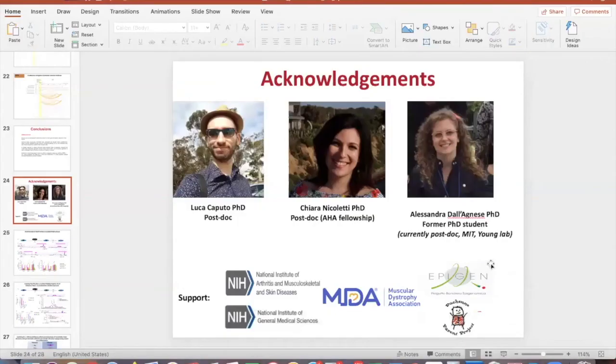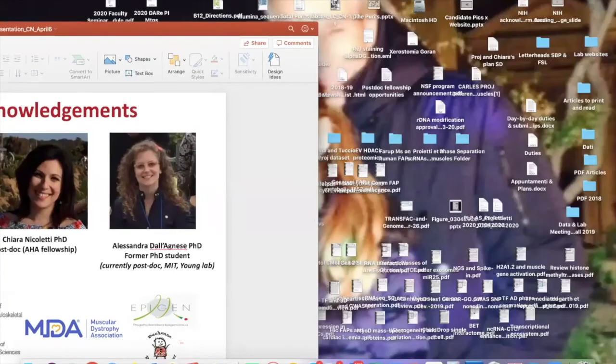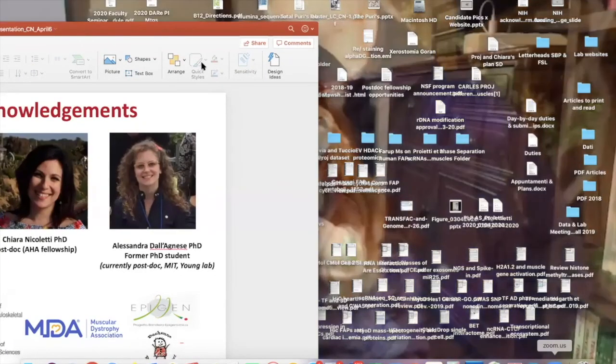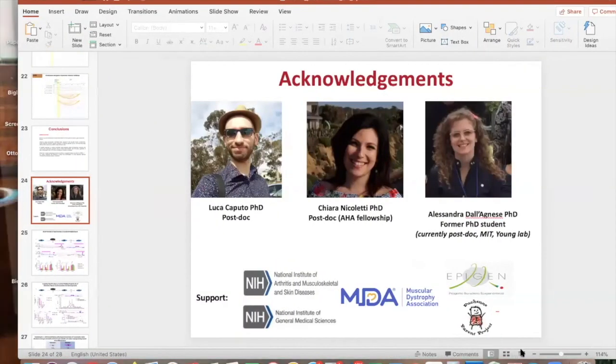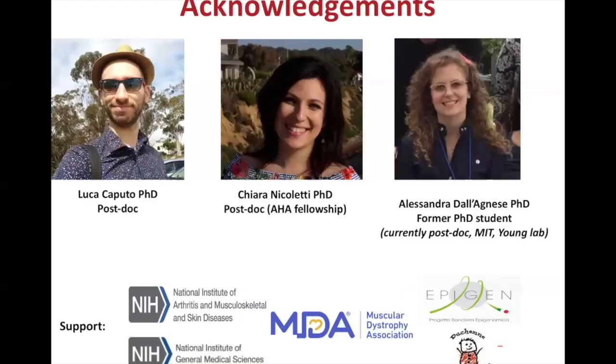Great, thanks Lorenzo. Got a couple of questions for you here. I know we're running really low on time. Let's start with maybe the second one, which is, it seems like the next step would be to look at HiChIP using something like MyoD. Do you plan on doing this, and what would you expect, and how would it add to your existing K27 acetylation HiChIP data?